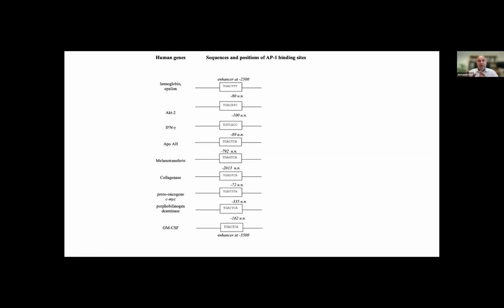This means that if you build any model for predicting these transcription factor binding sites, for instance the positional weight matrices we were talking about today, to recognize those sites in the genome, you will find many, many hits, because you have to allow not only the short region but also the variability.